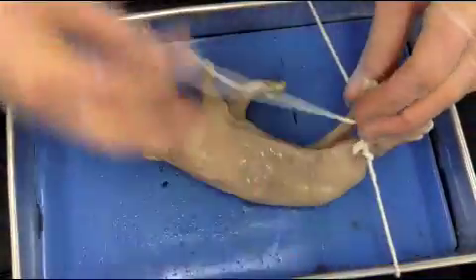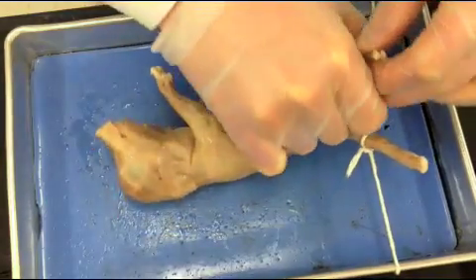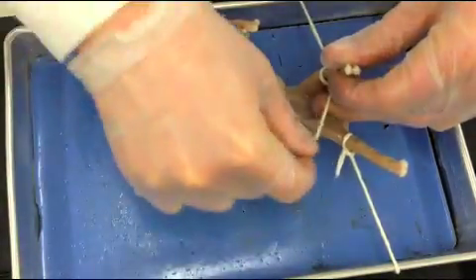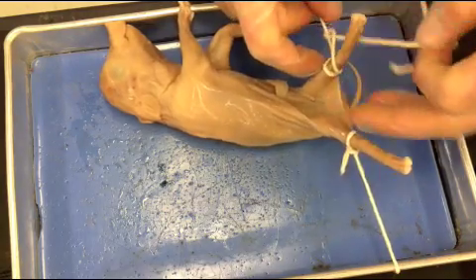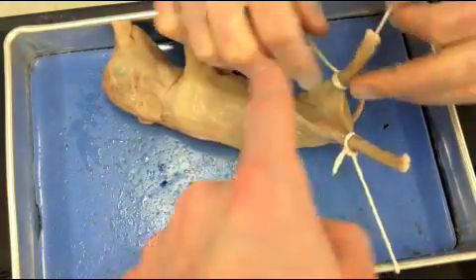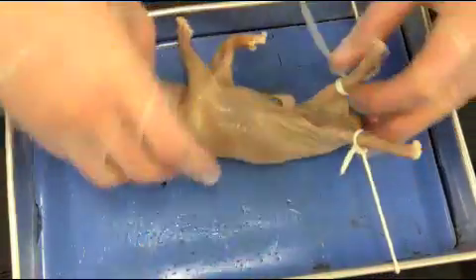Then I will take my string and wrap it around and tie it around the other leg. You want to tie it so that the legs are spread open so that you can access the middle of it and the legs are not in the way.